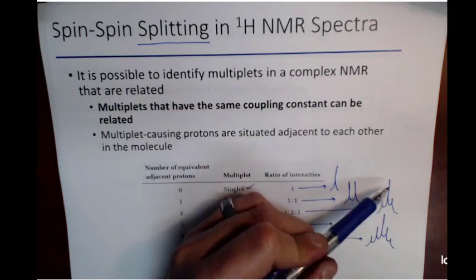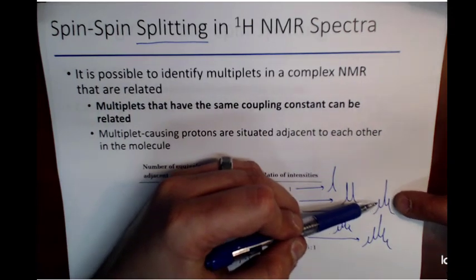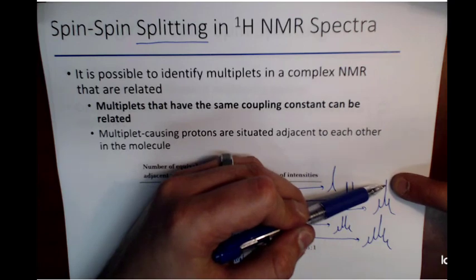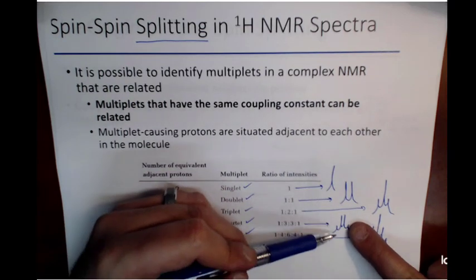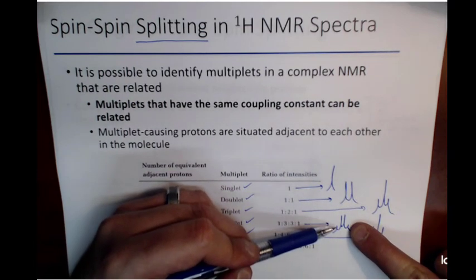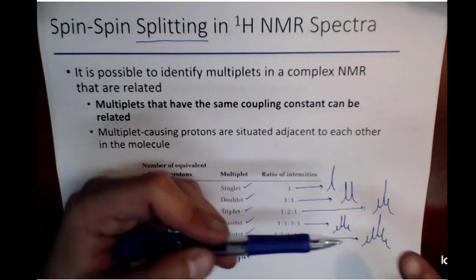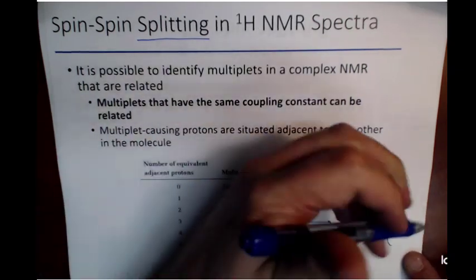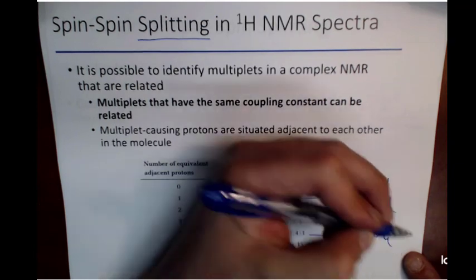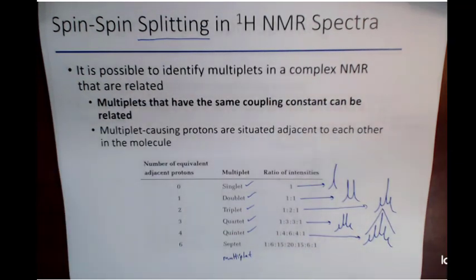In a triplet, you have three peaks where the ones on the extreme ends are the same height, while the one in the middle is taller. And you see that kind of keeps going as we move to more and more. So go into quartets and quintets, right? These two on the end are smaller, the same height. The two in the middle are taller, the same height, right? Quintet, see the symmetry yet again? It just kind of looks symmetric, right? Has symmetry about it.